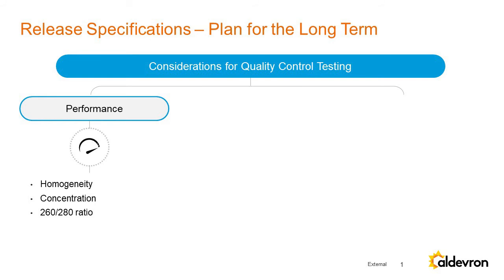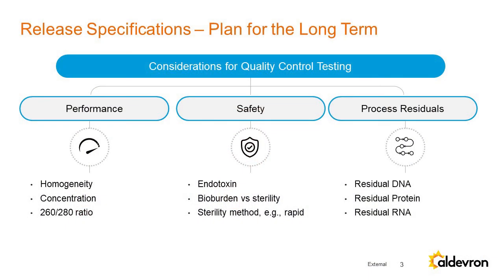Per the most recent FDA guidance on CMC, it's recommended plasmids be tested to ensure identity by sequence verification as well as restriction digestion. I'll refer back again to the comments I made previously about ITR retention and confirming those via restriction digest with SMA1 or AHD1, as this is a really critical point. Aside from these usual suspects of identity assays, the agency has also nodded to the importance of understanding the ability of your process to remove residual impurities, thinking about things like endotoxin or residual host genomic DNA, RNA, or proteins. This will help in establishing comparability for future production runs or comparability if you're making any modifications to the process later on.